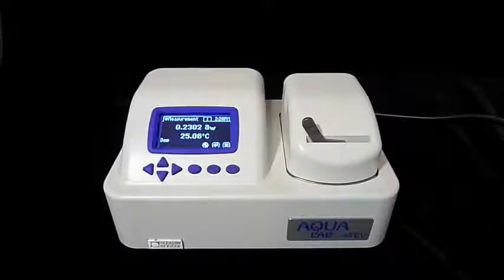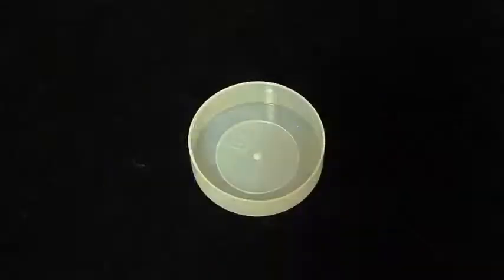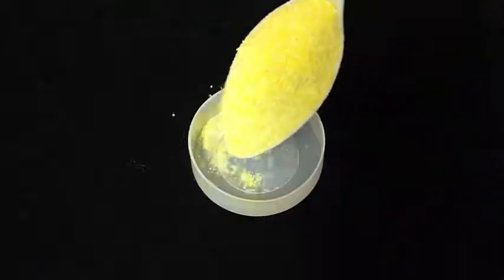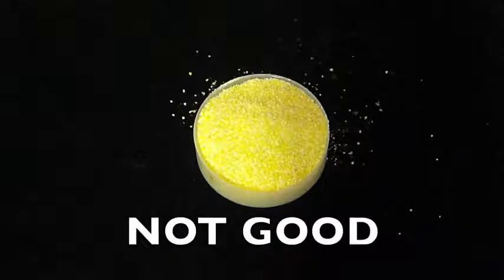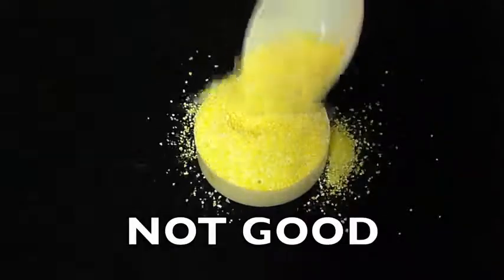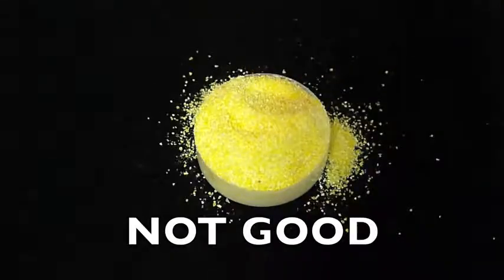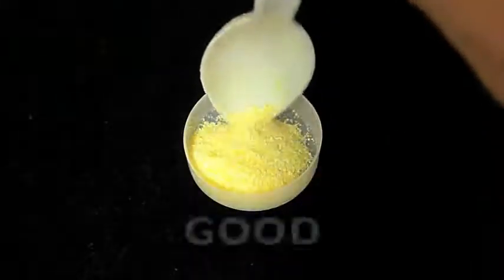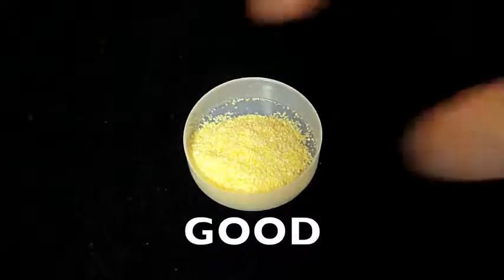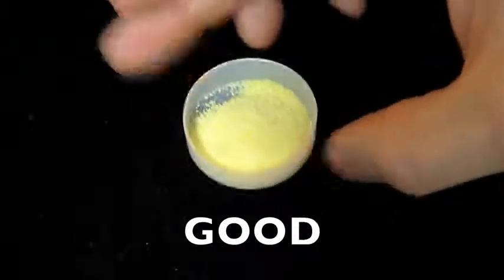Let's start with this cornmeal sample. In sample preparation you want to cover the bottom of the sample cup with the sample material, but it doesn't need to be more than half full. A too-full cup increases the chance of spilling sample into the sample chamber. With a powder or flake, just sprinkle enough to cover the bottom of the sample cup. You can carefully shake or tap the cup to distribute it evenly.